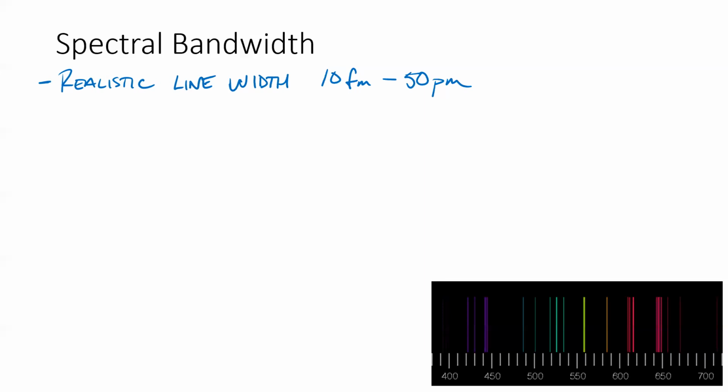That's, let's see, 5 nanometers will be 1%, and so 50 picometers is 1% of 1%, so 1/10,000th is the breadth, and if it's down near 10 femtometers, it's even narrower, right? And so these are very narrow transitions.